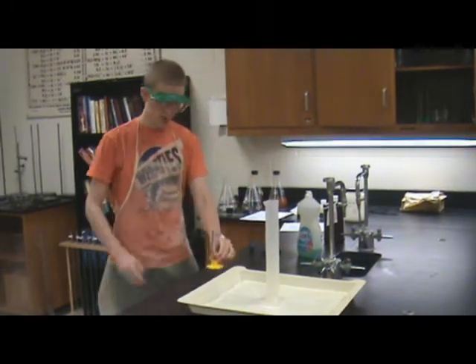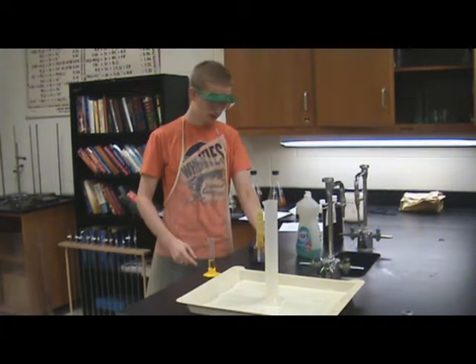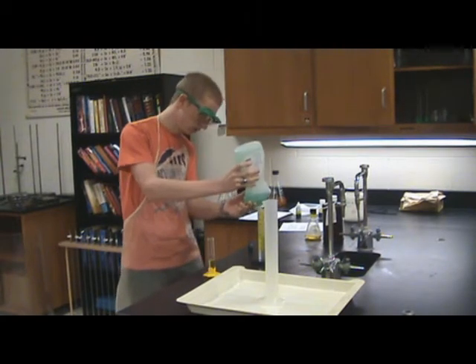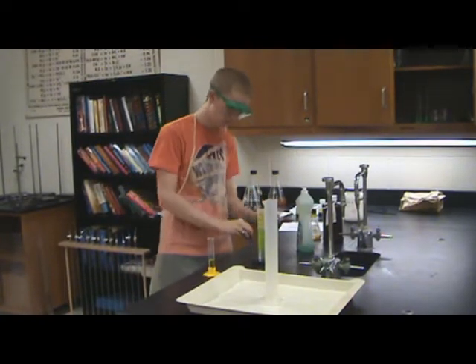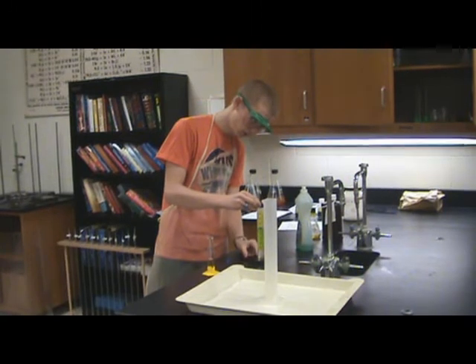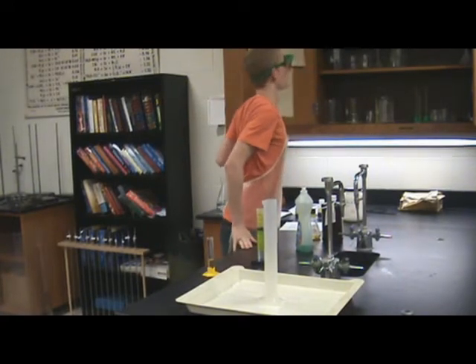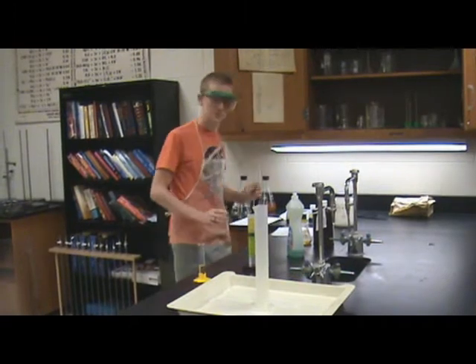So right here I have some KI solution, but first you're going to have to get hydrogen peroxide in a graduated cylinder, and then we're going to add some soap to that. About 10 milliliters, and then food coloring — 10 or 7 drops. Then we need a stirring rod. I'll clean it off.